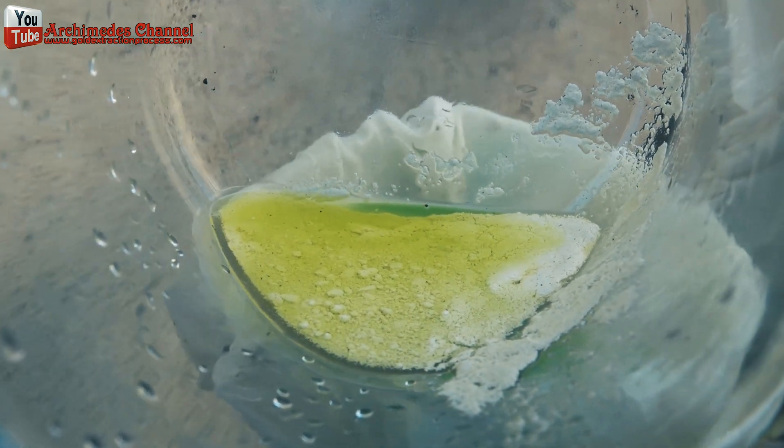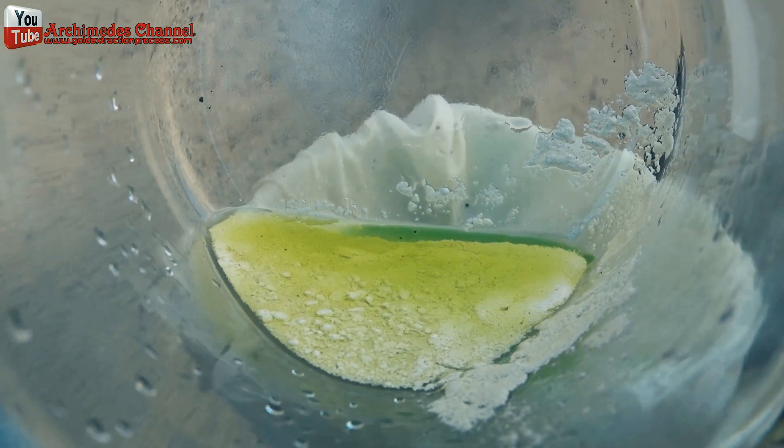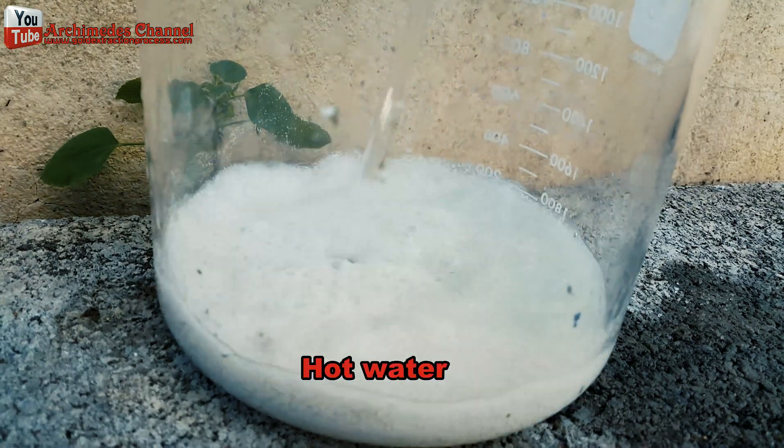Precipitate the silver. Clean the precipitate with 2 to 5 times hot water.